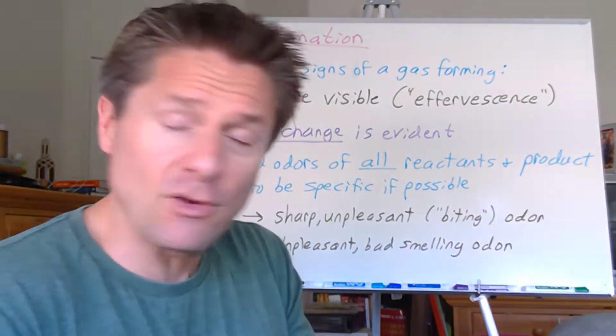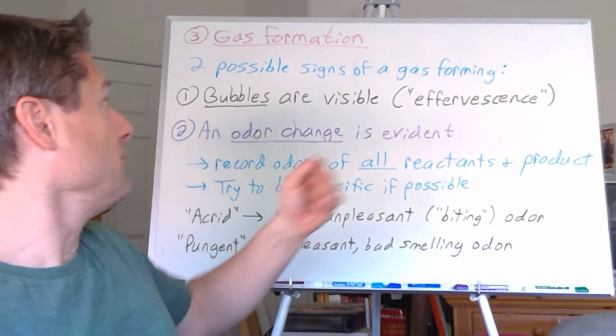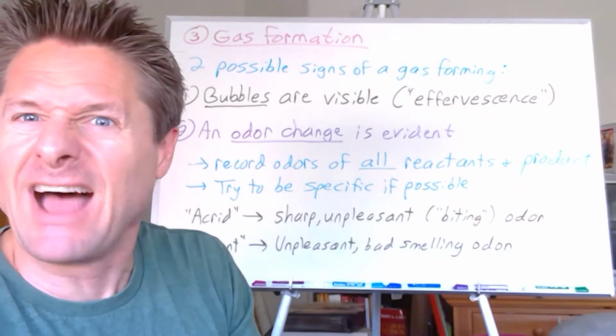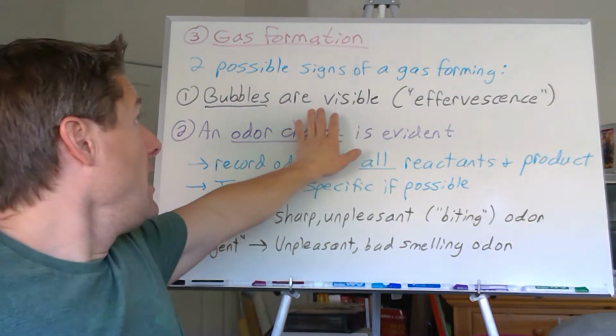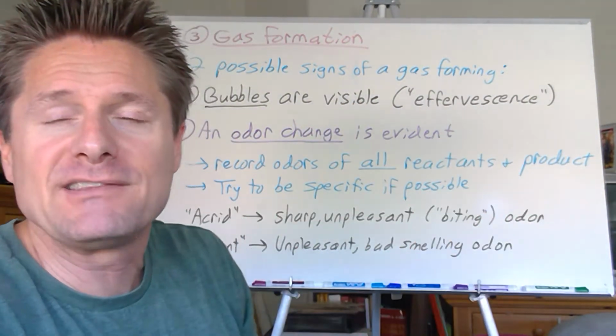So if you don't see bubbles, you don't need to write that. Only write it if you see them. So you don't have to say no bubbles were visible. That's obvious if you don't write it. The official term is effervescence, but I hardly see anybody use it.